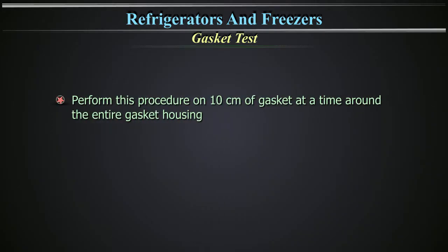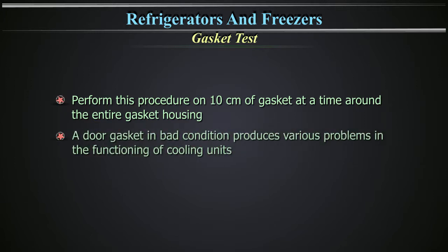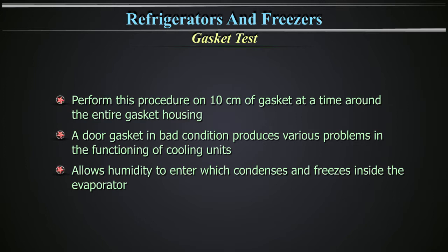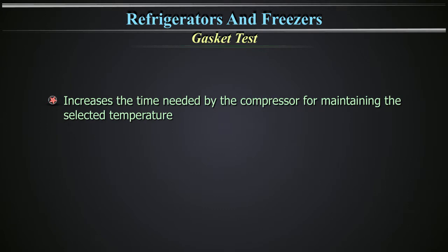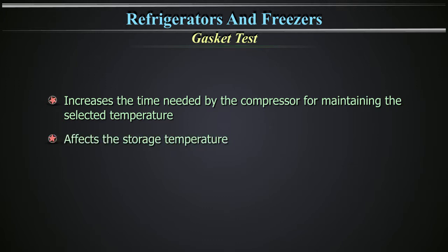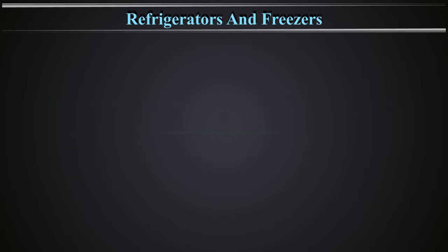Perform this procedure on 10 cm of gasket at a time around the entire gasket housing. A door gasket in bad condition produces various problems in the functioning of cooling units, as it allows humidity to enter which condenses and freezes inside the evaporator. It increases the time needed by the compressor for maintaining the selected temperature, affects the storage temperature, and increases operational costs.